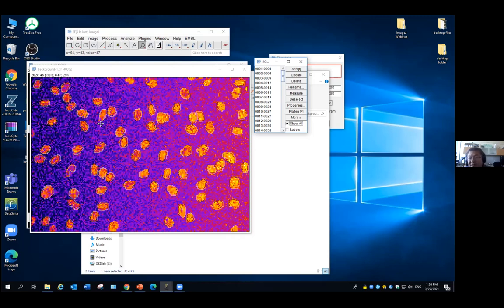Okay? So with image analysis, it's the same. It's also coupled with the image acquisition. Do not separate them. Okay? I saw users who spend two or three months on the microscope, get all the data, and then say, okay, now I'm going to write a paper, I'm going to analyze the images. Then they realize, oh, my image is too noisy. I should have used a higher magnification to get better resolution. Then it's kind of too late.